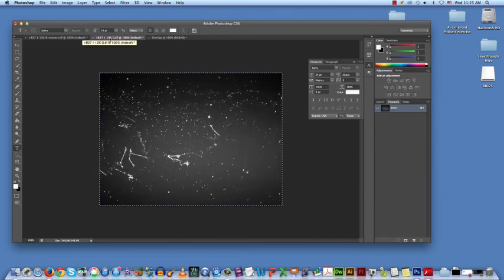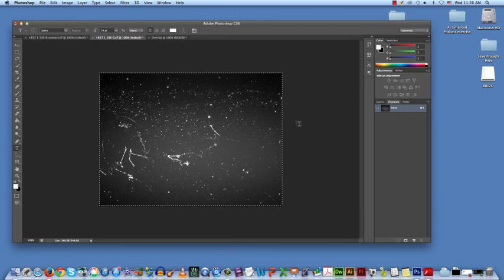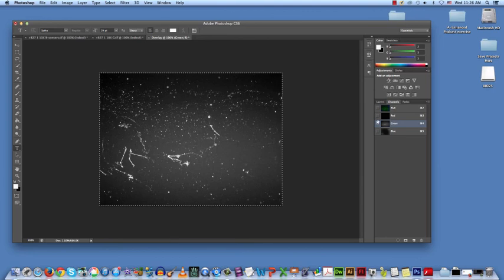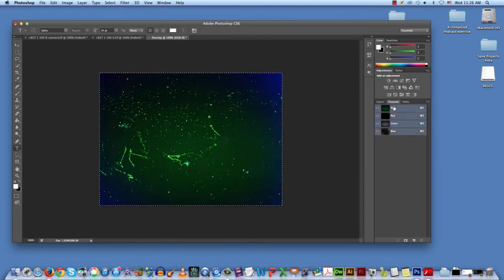Now you go to your corresponding axon image or neuron image, which should be green. You can go to your overlay image, pick the green channel, and paste your axons. And now you should have an overlay of those two images with the cell body corresponding to an axon. Now I'm starting to wonder whether these are in fact corresponding images, but here's a cell body here that presumably has an axon here. All right.